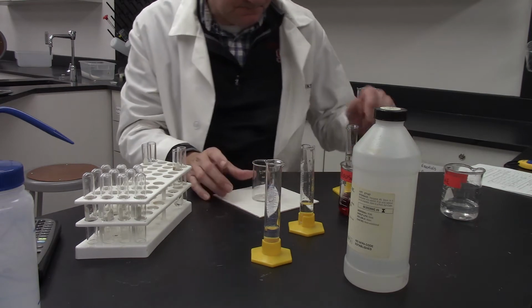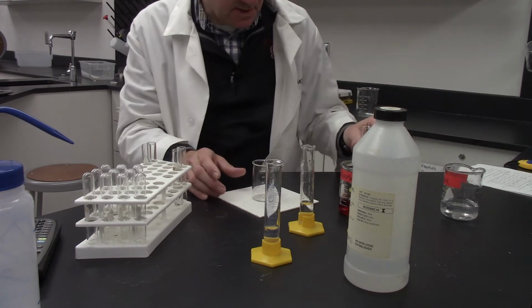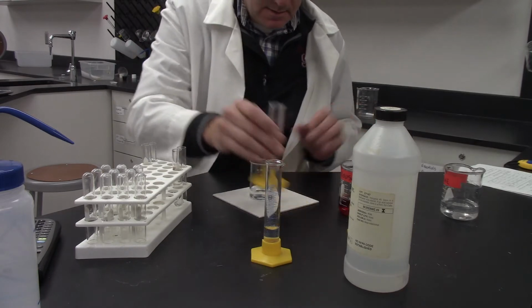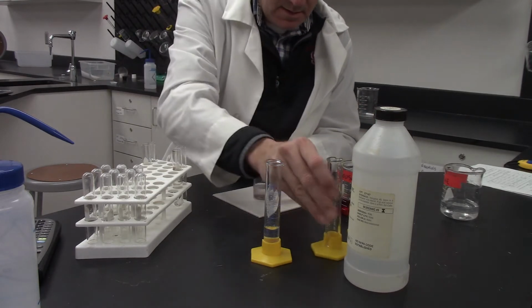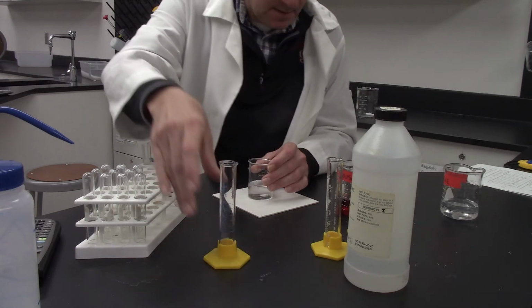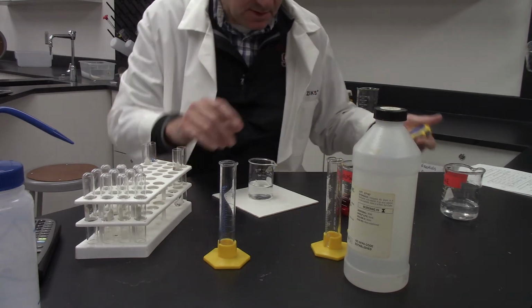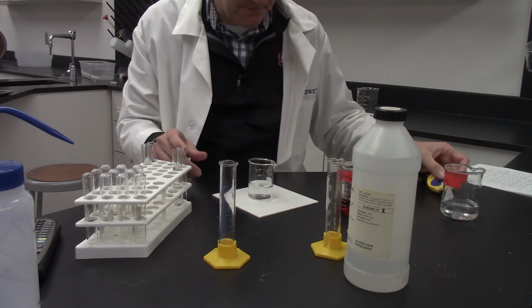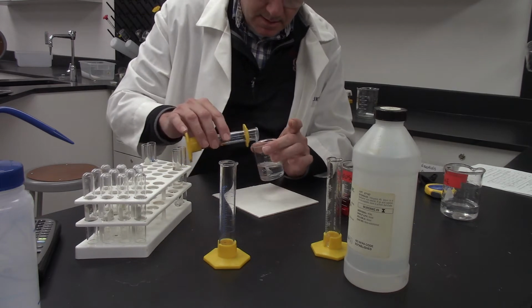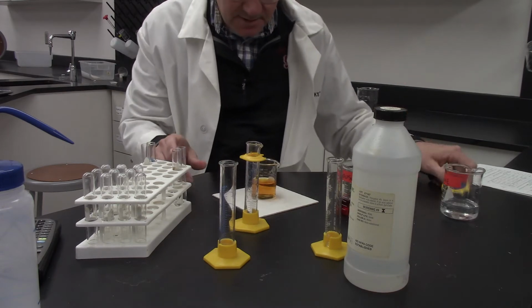Okay, so here's what we're going to do. I'm going to add the iodine last because that's what's going to start that reaction. So I'm going to add my acetone, my hydrochloric acid, and my water. Okay. So then I've got the handy dandy stopwatch. I'll start that as soon as I add in the iodine. So I've added the iodine. I'll start the stopwatch. Okay.